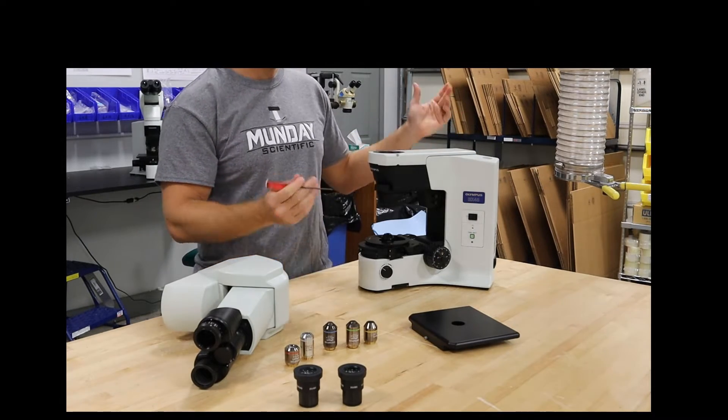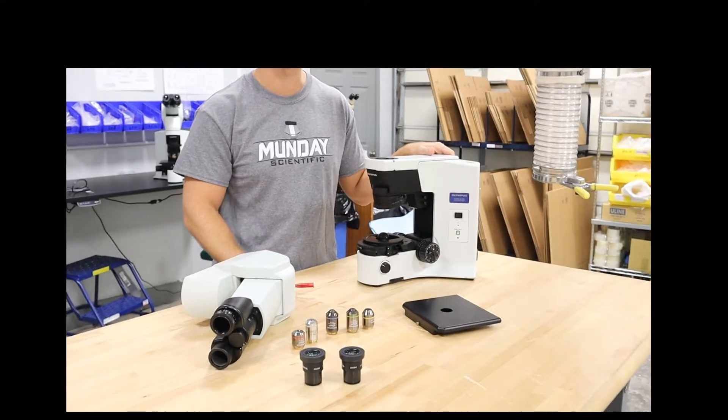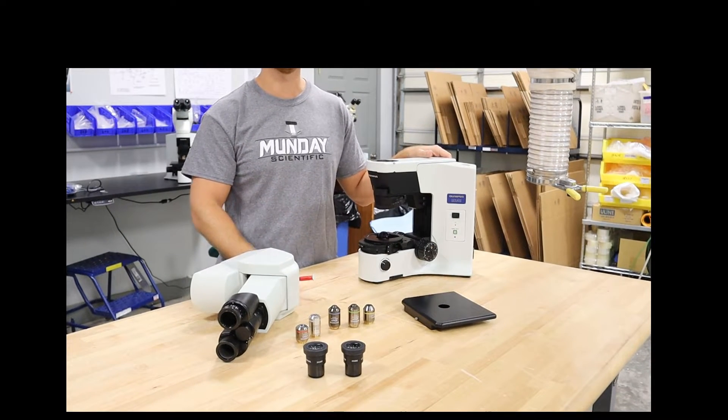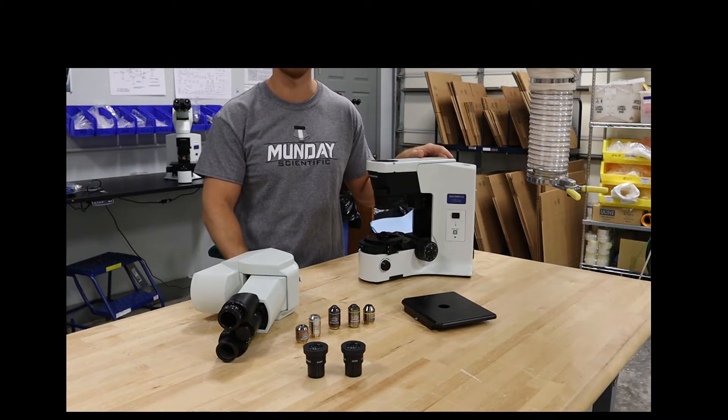Once you have all of that, the scope is pretty much ready to pack — just bubble wrap everything. Watch our packing video. You can look at our other videos on YouTube and we'll be able to help you out with that too.